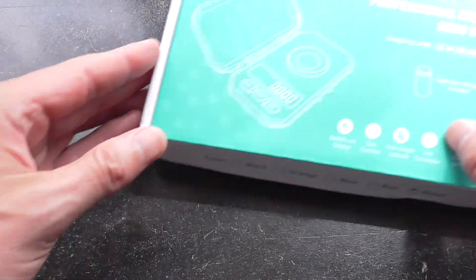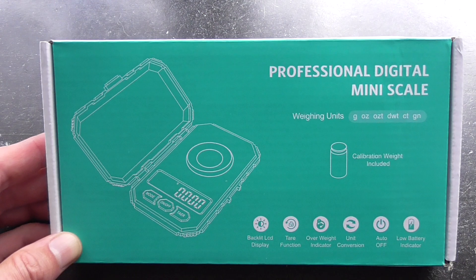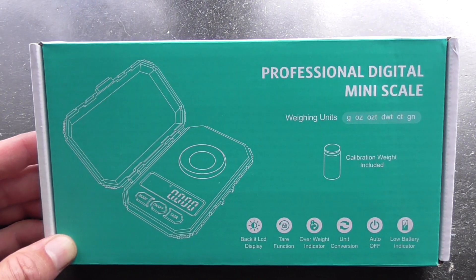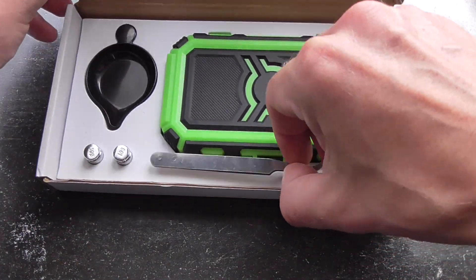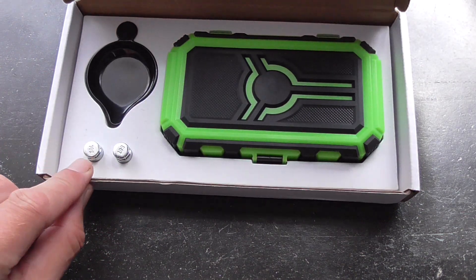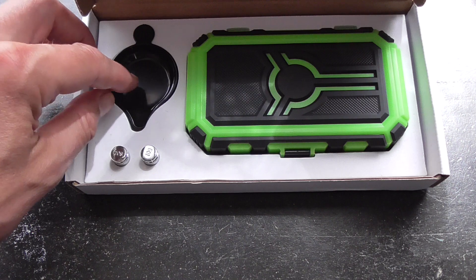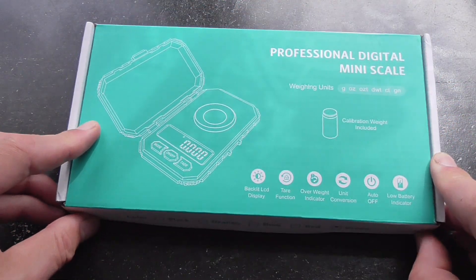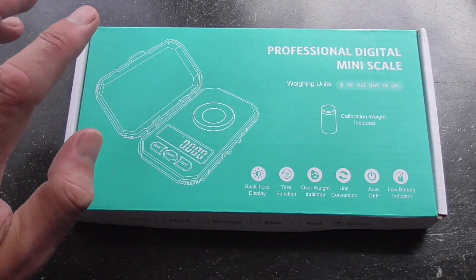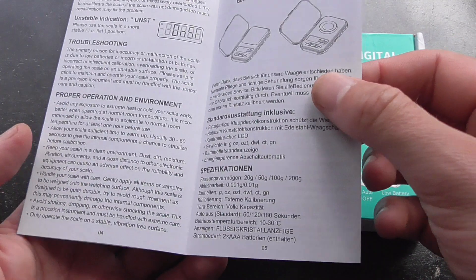If you want to have a look at the package of the scale, here it is. As I said, it can be found on AliExpress, same as the syringe. That's what comes with it: some tweezers, two 10-gram weights — not 10 milligram, 10 gram — and this little bucket container, and of course the scale. Some instructions come along as well. I'm pretty impressed by the scale and also by the syringe, and I can recommend it.